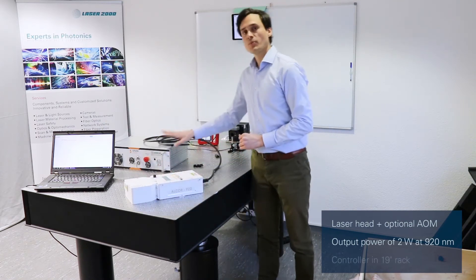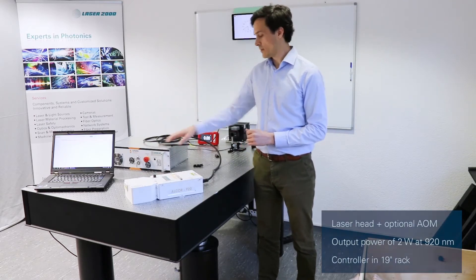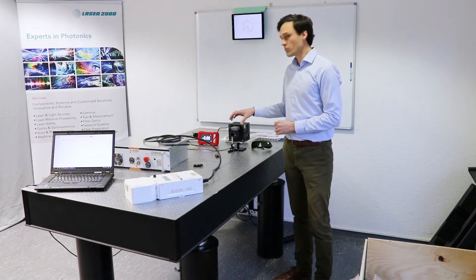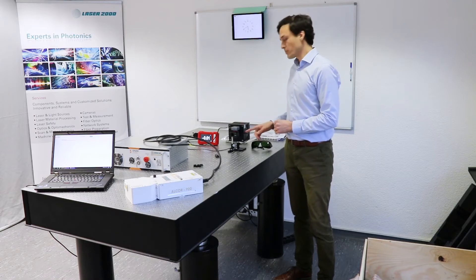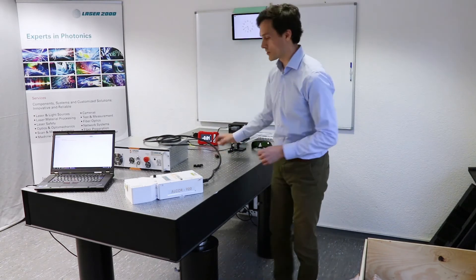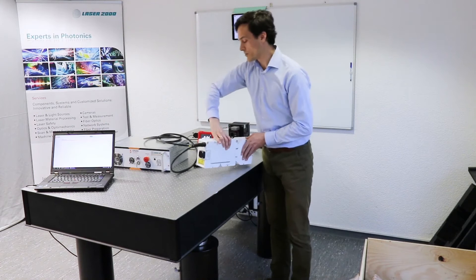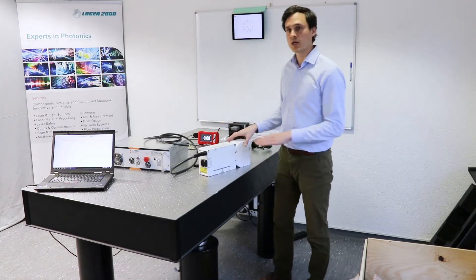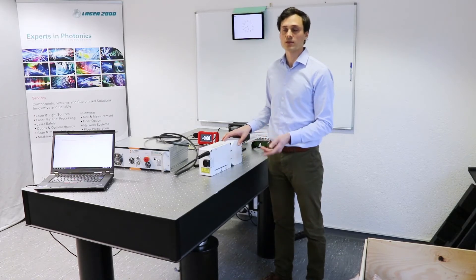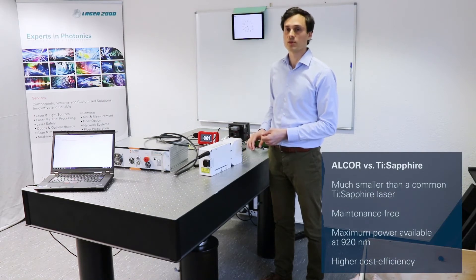The other part is the controller in 19-inch rack format. We have a small setup here which consists of a beam profiling camera from DataRay, a beam splitter cube, and a power meter for power measurement. We also have some alignment clamps for easy alignment. We can set up the laser in upright position so that the aperture has the same height as for the Titanium Sapphire laser, which is usually used for multi-photon microscopy setups.